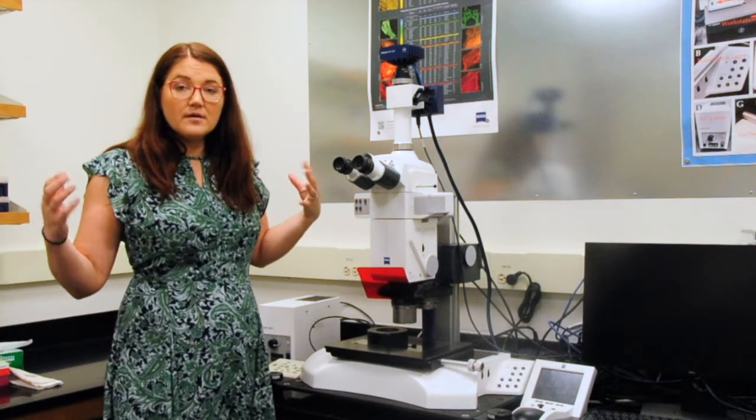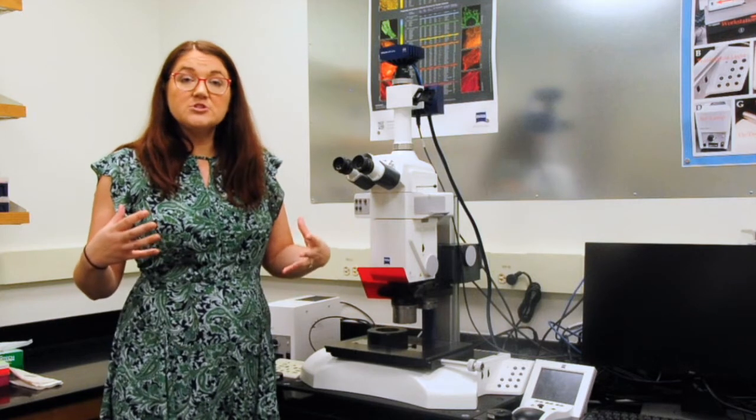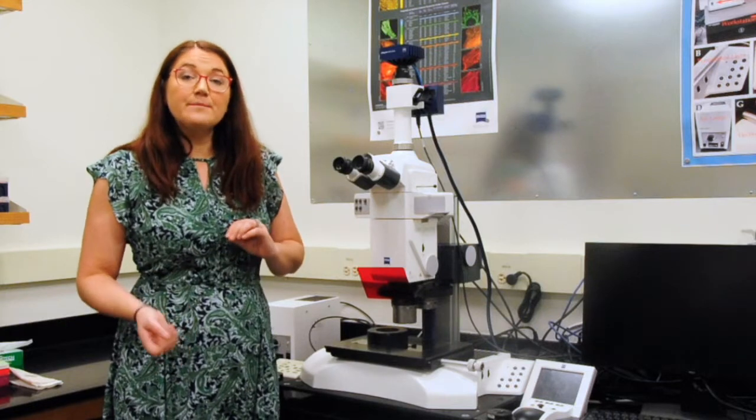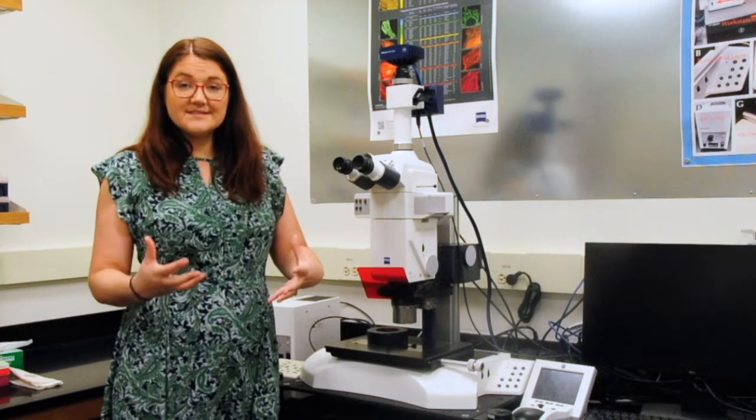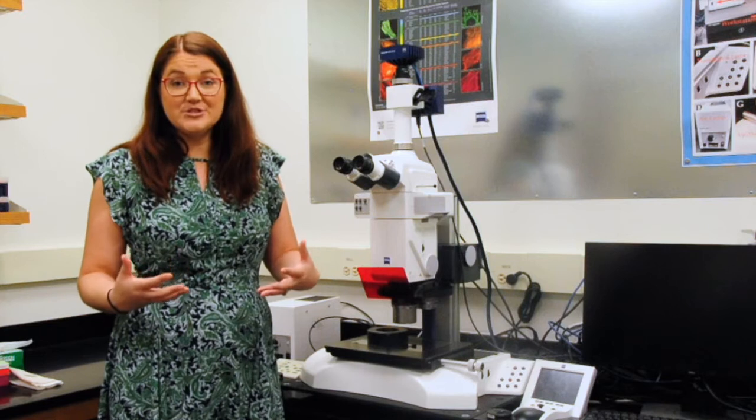The reason we have two cameras on this is that we have one that's a color camera for anyone doing something that they may actually want to see the pigment, the color pigment, as well as a monochrome camera, which is more sensitive so that we can do our fluorescent imaging with this.